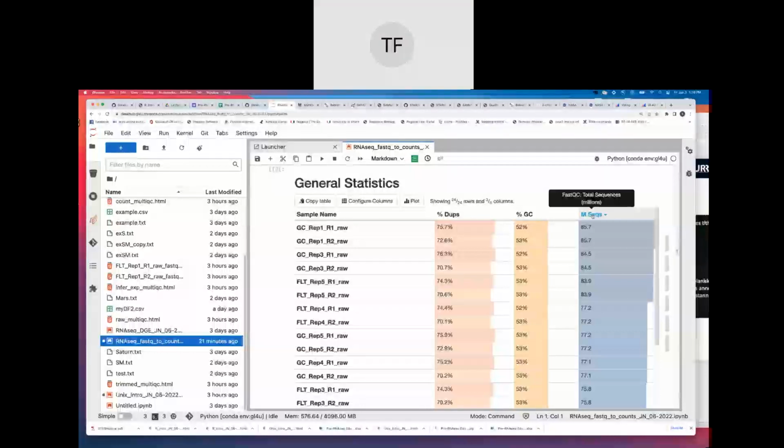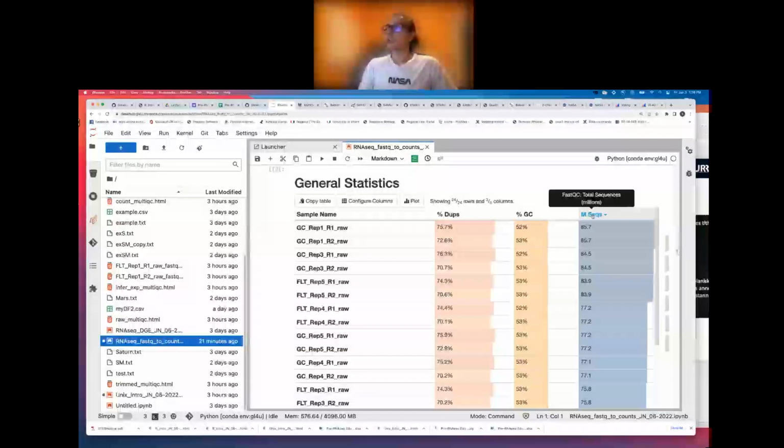No, if it's normalized. Okay, yeah. So you really don't want to get a too crazy range here, right? You want everything within the same ballpark.